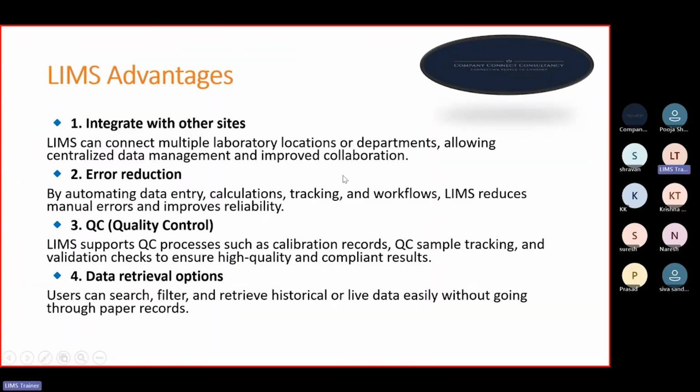Then LIMS provides error reduction by automating data entry, calculations, tracking, and workflows. LIMS reduces manual errors and improves reliability. Okay, so here we have automatic data entry. We have predefined, pre-validated calculations created by the master data team in the software.